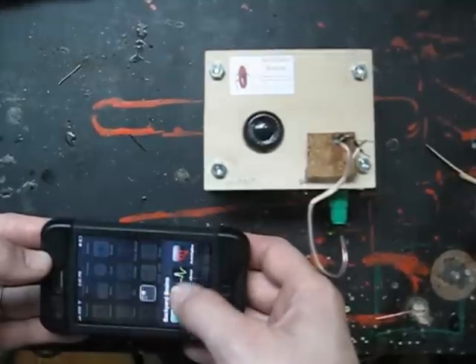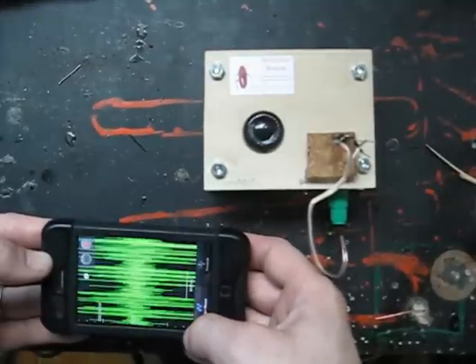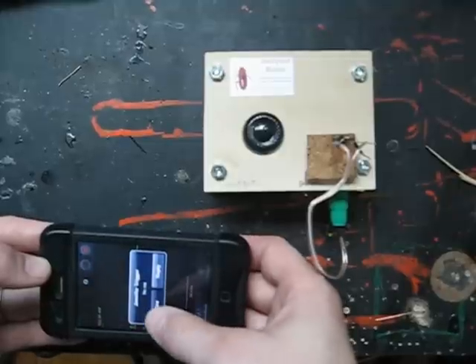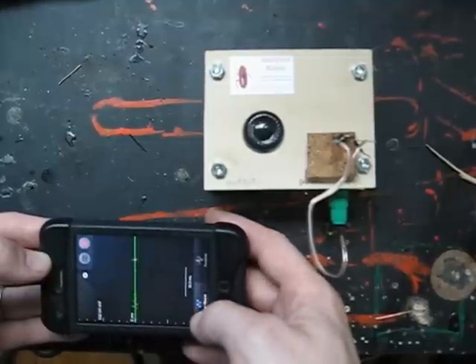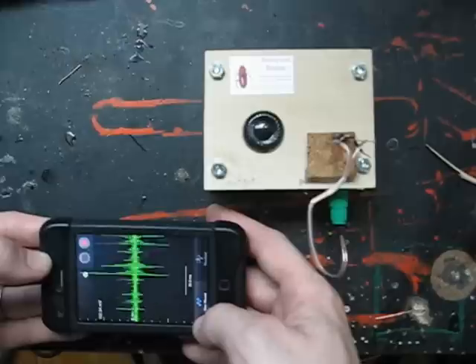Now we're in the modern age with all its lovely technology — you can use your iPhone to record spikes. But when you receive text messages, the 3G network that you're receiving those calls and messages on is interfering with the amplifier of the spiker box.